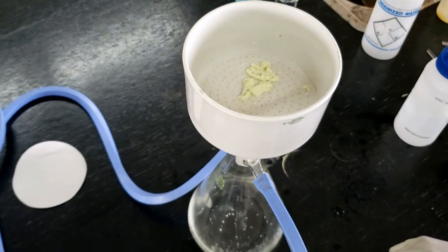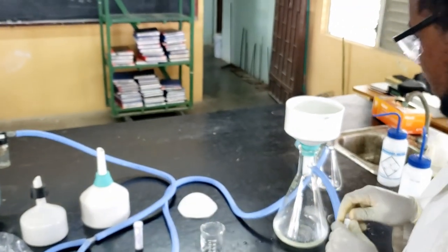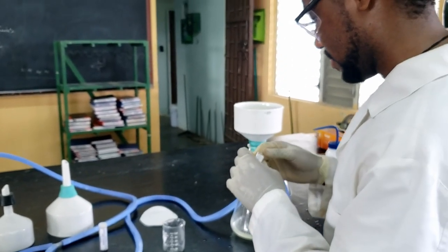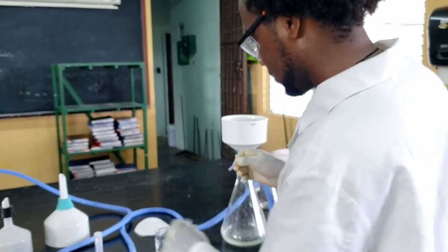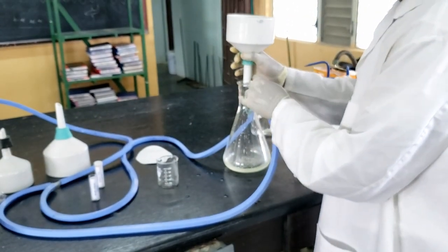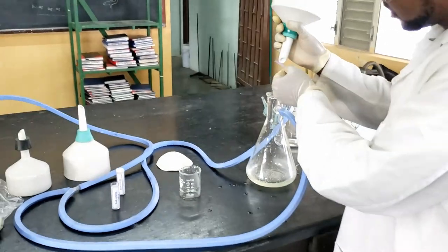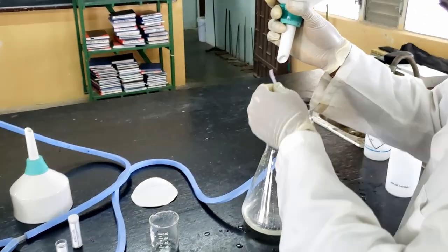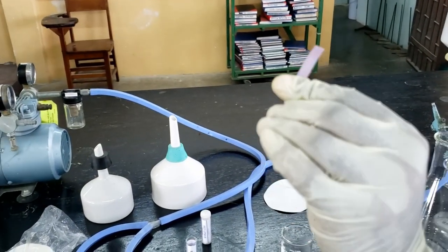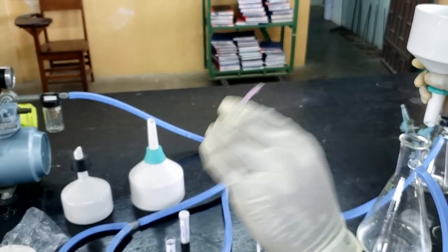Let's pause and let's test with litmus. I have a piece of blue litmus paper here. And we just want to check to see if the water that's coming off is still turning the litmus red. So it's still kind of red. So we're just going to wash a little bit longer and we should be good enough to move on.